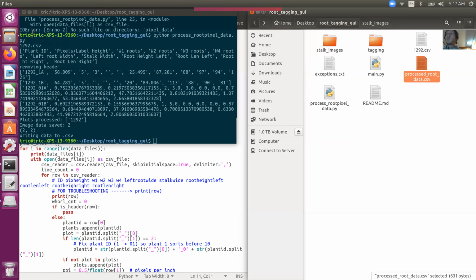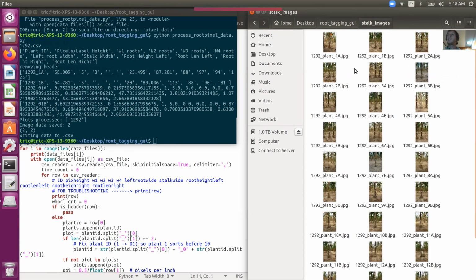So that's really all there is to it. At the end, you should have at least 2 things, and if you made an exception, 3 additional documents that appear, and more if you're going to rename these. But that's it, and you're going to replace these every time you do a new set.